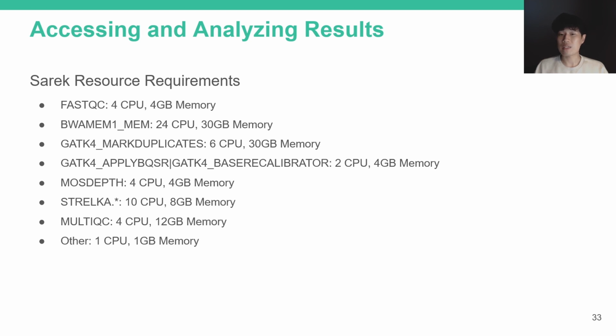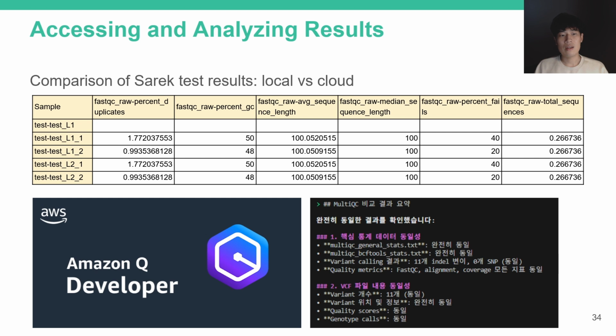Still, before explaining why AWS HealthOmics took more time than my local computer, let me make one more thing clear. Was the task profile recreated properly in HealthOmics? And my answer is yes. I think I recreated the environment quite perfectly.